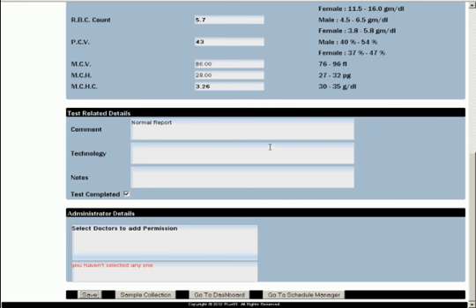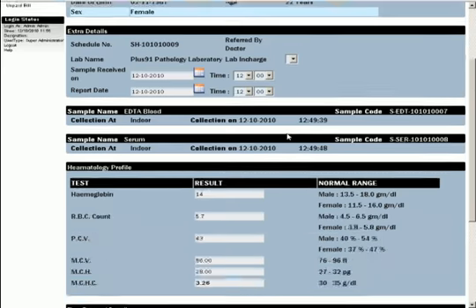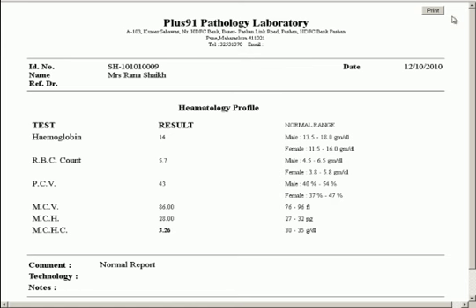In this way, a new template has been created, added to the system, and used to create a report within minutes. This gives the software a lot of flexibility, and you do not need to come back to us to create new reports time and again. Even the printout looks like it has been professionally designed.